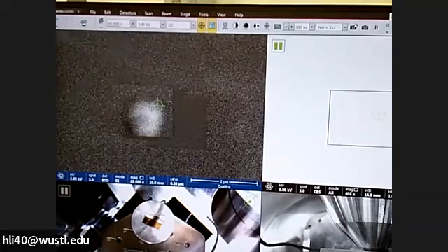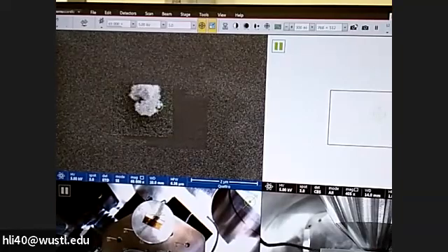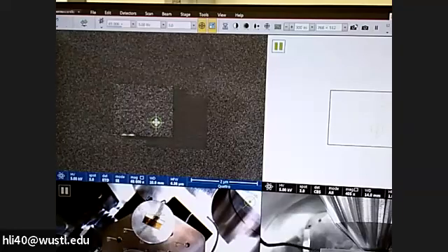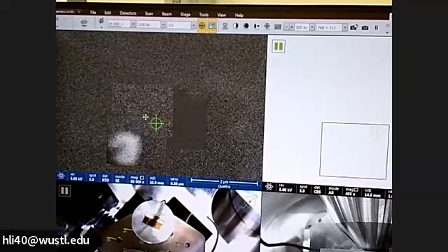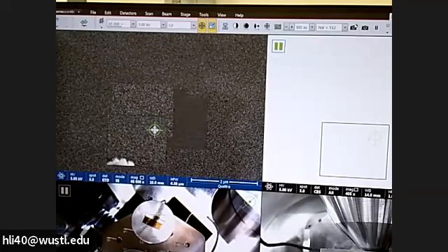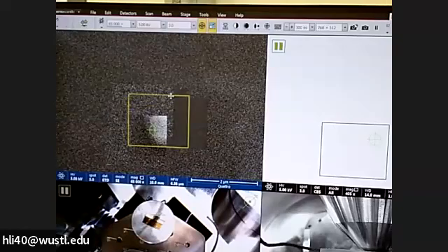When you see this type of movement, you can also see this target, the green target here. So you just simply move it. If it's up and down, you move the target up and down, and this will make the jumping less. If your particle is out of the window, you just simply move the window to check it, okay? Now you will see it's mostly left and right. If you want it still in the center, double click, and this particle will come back to the center of the screen.